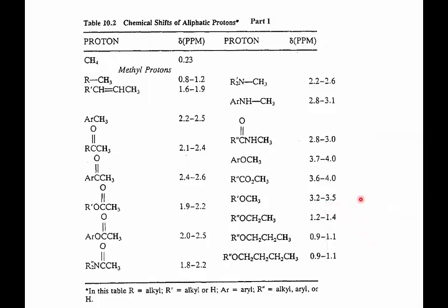Let's first talk about the effect of molecular structure on chemical shift. Protons in a molecule that are of the same type, that is all primary, all secondary, or all tertiary, that are in similar molecular environments tend to have similar chemical shifts, that is similar delta values. Conveniently, these values are available in tables. You'll find such tables in the packet on NMR that's posted on Blackboard. There's also a table in your textbook, and you can also find such tables posted on various websites on the net.